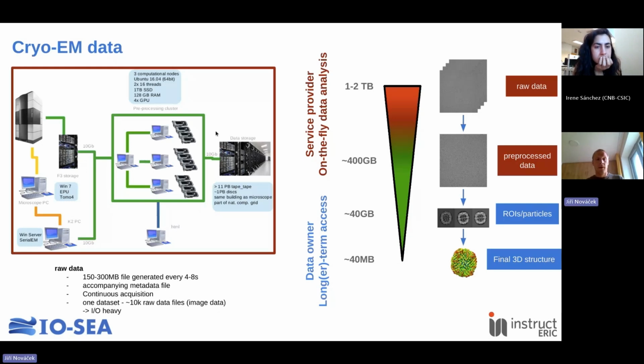Eventually, this poses yet another need for the facilities to have not only the instrumentation, but also a particular infrastructure for the data processing and data storage.